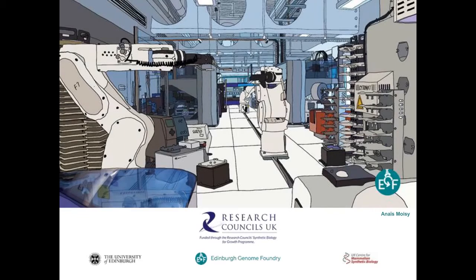Do you somehow pre-screen your colonies before picking them, or is it a random pick? Well, that's a good question, actually. The Qpix instrument that we have is set up to be able to do a pre-screen because it has a fluorescence turret that allows us to image all the colonies for fluorescence before. We don't currently do that, but that is definitely something that we will do in the future.